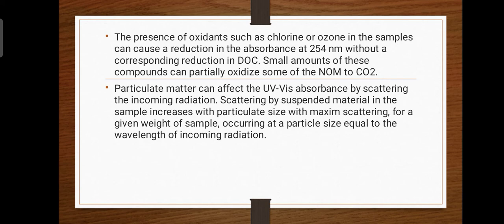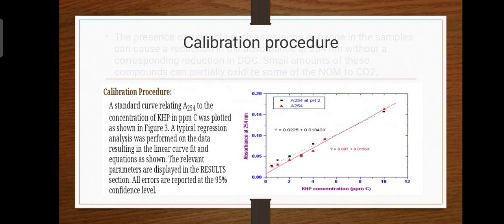Although the natural water sample in this study was unfiltered, there is little particulate organic carbon present and no particulate material was visible. Taubes et al. found that unfiltered clear samples of natural water were adequate to perform error-free concentration studies with UV-Vis absorbance. So then, let's move on to the calibration procedure.